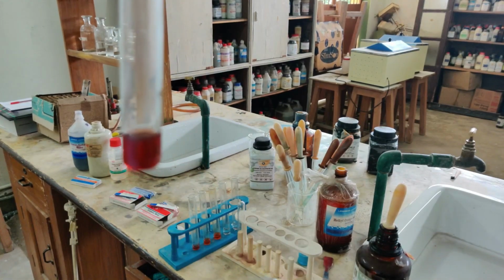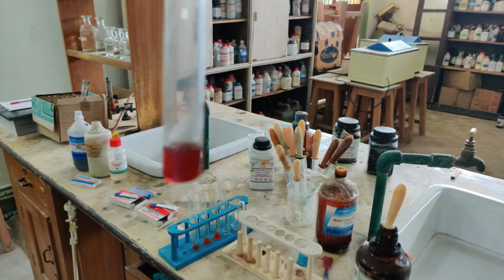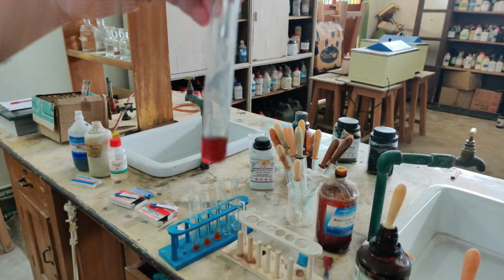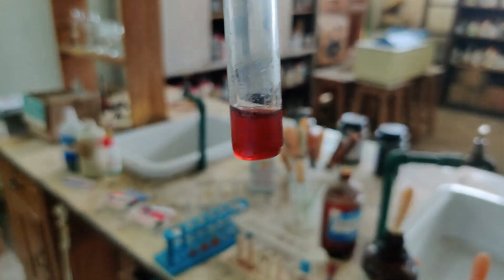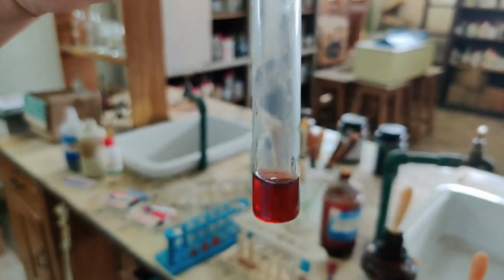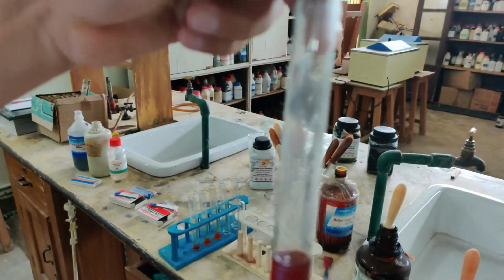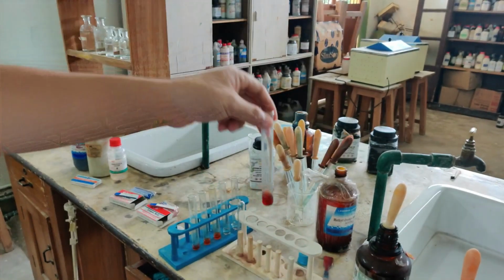Since initially it was blue in color, a blue litmus turns red. So when you add an acid, in an acidic solution, a blue litmus turns red. Again, for the last time, see how red it has become. It was very dark blue before, but now it has become red. So a blue litmus turns red when an acid is added to it. Okay, let me keep this aside here.